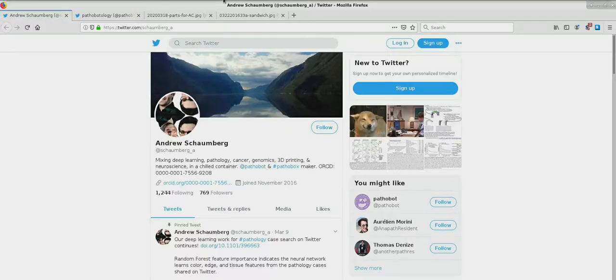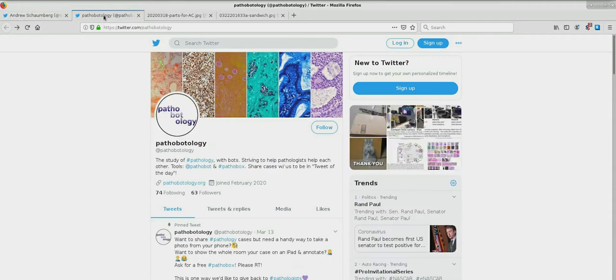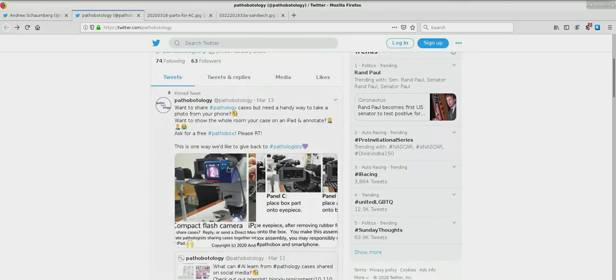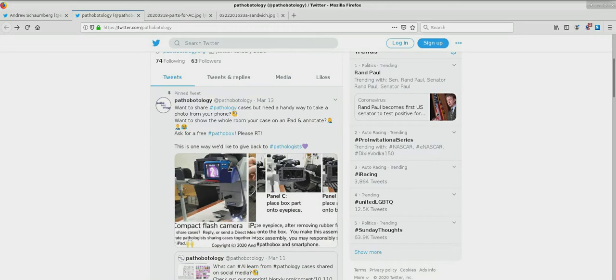Hello, my name is Andrew Schalmberg and I'd like to talk to you about Pathobox, to tell you how to put it on a microscope.